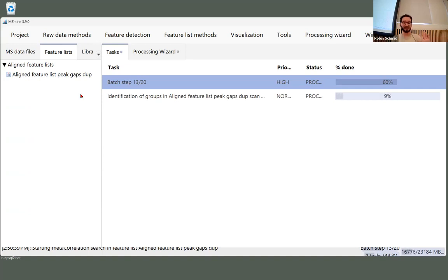And the other thing is Java applications. You can see on the bottom there's a memory overview, how much memory are we using and how much memory is free. And Java's kind of lazy. It's just going to grab all the memory that's there if it needs to, right? And it's not directly freeing it for other tasks. But if there are other tasks and Java does not really need the memory, it's also going to let go at some point.